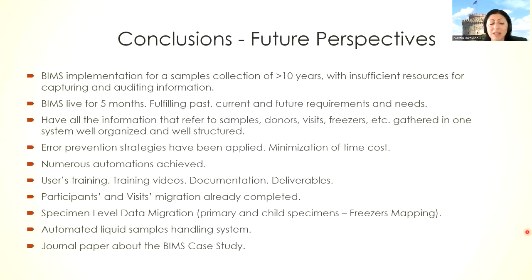It was successfully submitted. As I mentioned, an important part of data migration has already been completed. Of course, the specimen level data migration, it is still an ongoing task. It is a huge task if someone considers that there are 8 freezers almost full of specimens, some of them having a capacity of 50,000 samples. Also, the corresponding primary specimen information and all the relevant information about the already distributed specimens has also to be created in the system. And this makes it even more difficult if we consider that there was insufficient means for recording and auditing information in the past.